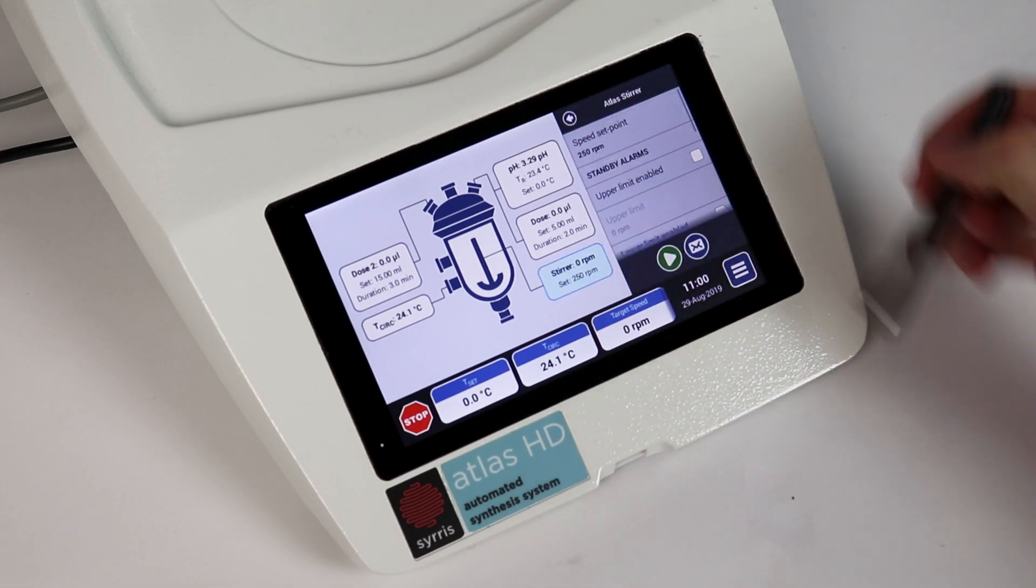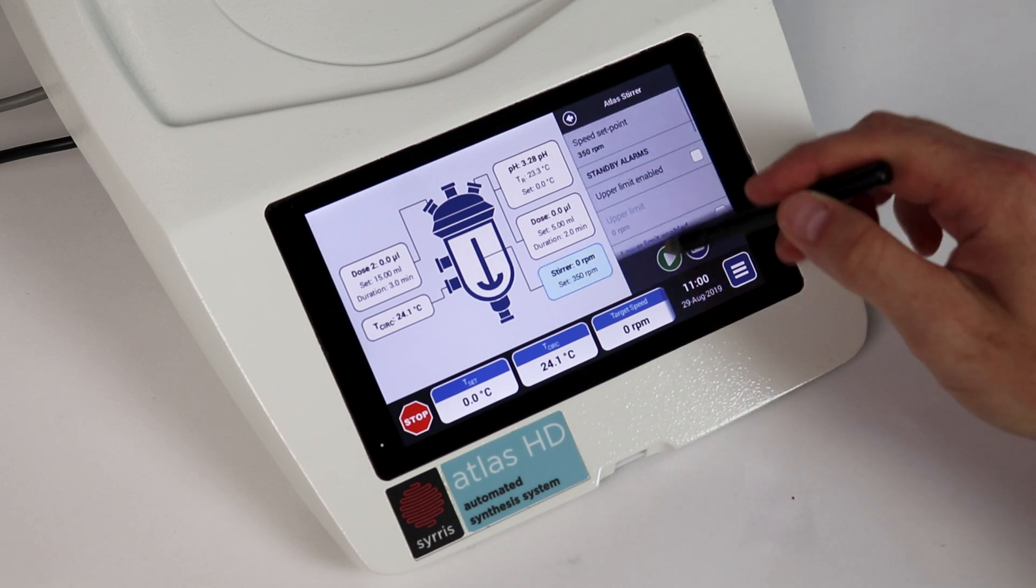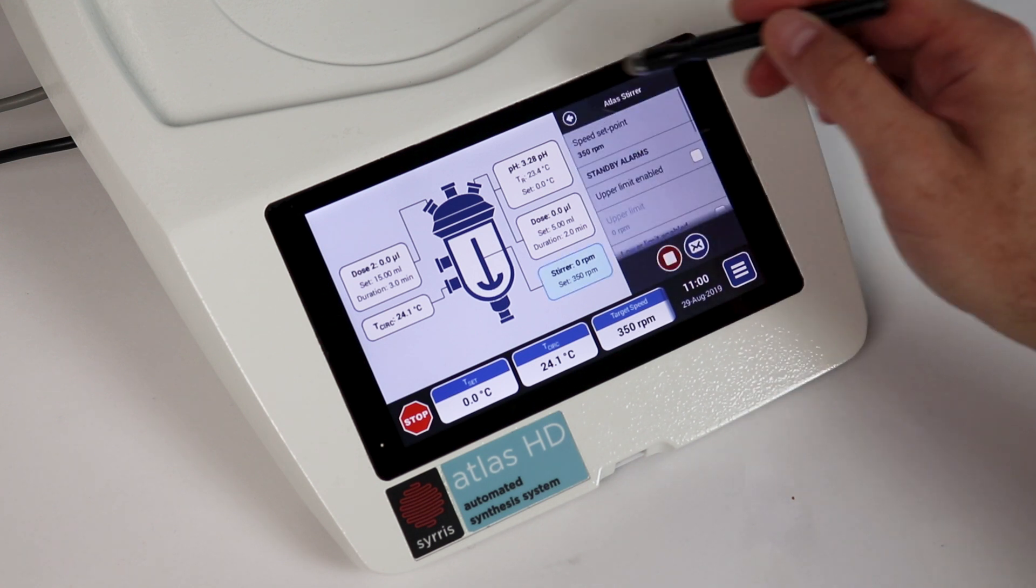Simply tapping on any piece of hardware will bring up its control menu, allowing you to manually input set points and get your chemistry up and running in a matter of seconds.